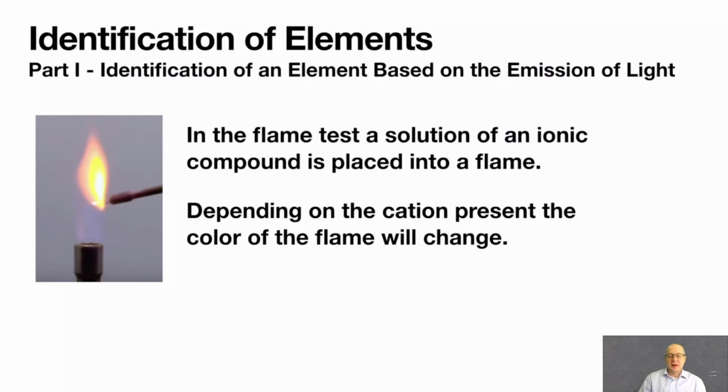Part 1, identification of an element based on the emission of light. It's cool, guys. I wish we could do this at home. It's just too dangerous: open flames, buying a lot of inorganic salts. We're not going to do this at home. I'm going to do it for you on a video. It's no problem. It's kind of fun.